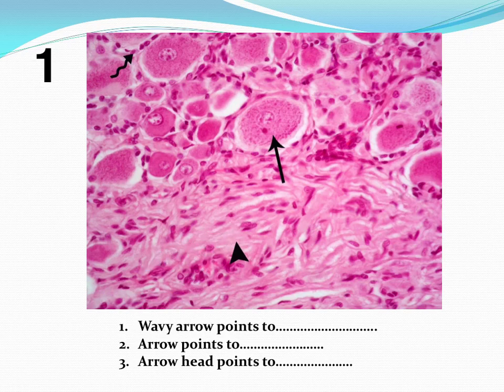These light areas and dark areas represent the myelinated nerve fibers present between the groups of nerve cells in this ganglion. This ganglion, of course, as you see, has cells of different sizes. So this ganglion is the spinal ganglion. And the cells also are unipolar and they are of different sizes. So this is the spinal ganglion.